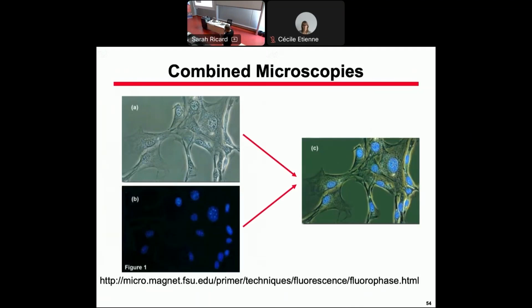When you make optical sectioning in fluorescence, the underlying hypothesis is you observe fluorescence. You cannot observe the sample. You observe the fluorophores you have put in the sample. So to reconstruct, the hidden hypothesis is your sample is homogeneous. But if you see this, your sample is not optically homogeneous.